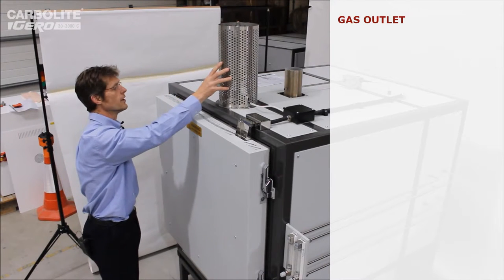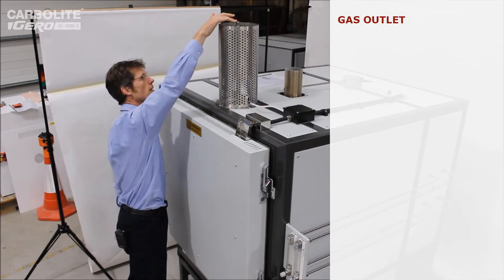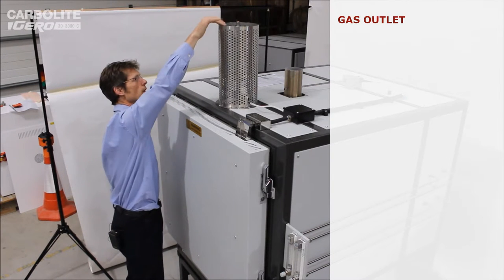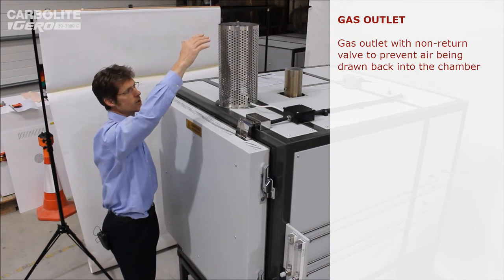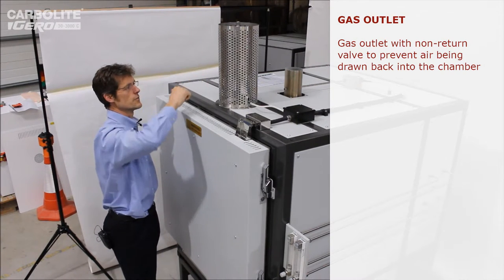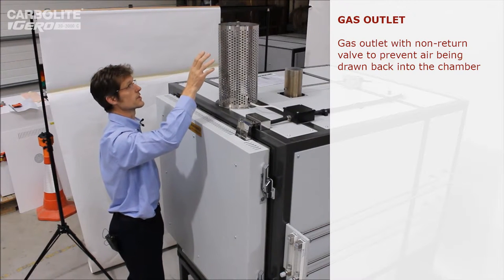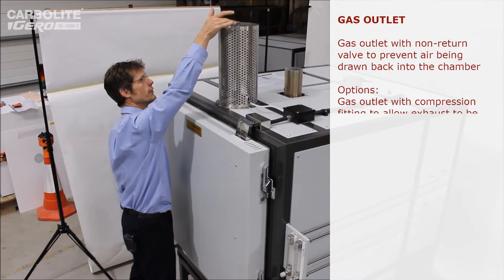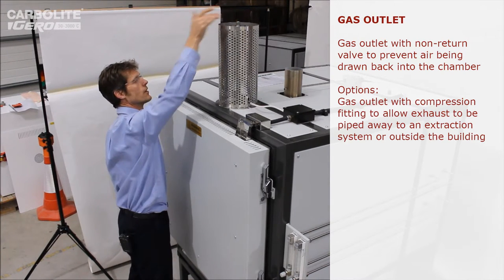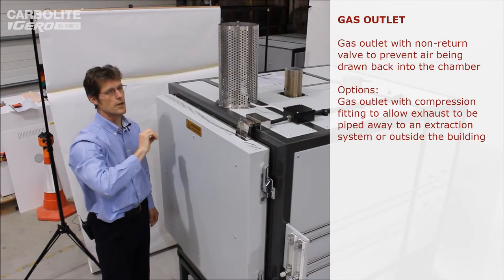On the top we can see the exhaust system better — this is where the nitrogen comes out after passing through the chamber. Inside this little box is a non-return valve which makes sure air can't diffuse back into the chamber. Normally the nitrogen is just vented into the room, but in this case we've fitted another compression fitting so the customer can pipe the nitrogen away into a suitable duct.